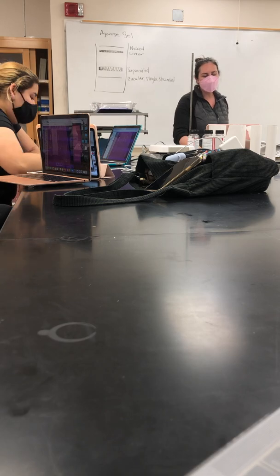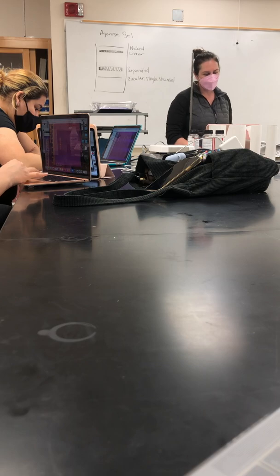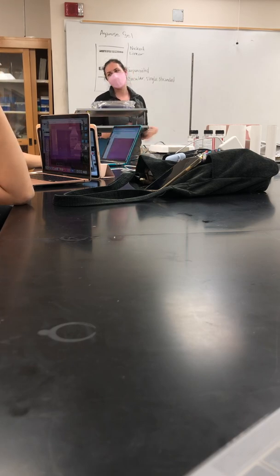And then for the agarose, if you really blow it up, and I mean really blow it up, you can kind of start seeing some of the other parts of the bands. It's very blurry, this one, for your agarose. So you should see some nicked DNA. Can anyone tell me what the nicked DNA is? It's kind of self-explanatory, right? It's nicked, right? It's in fragments.